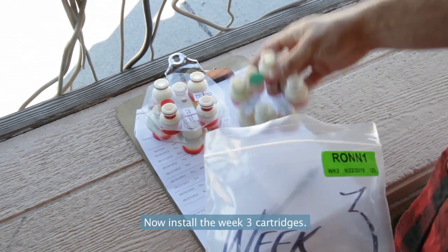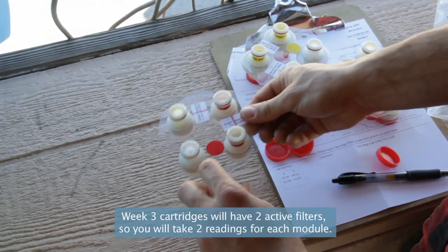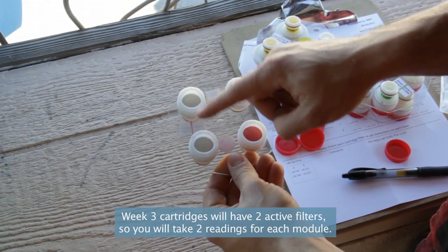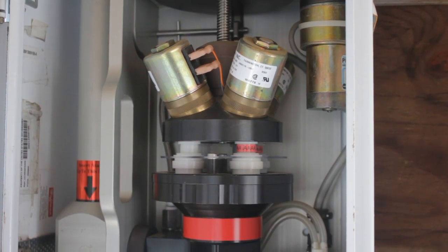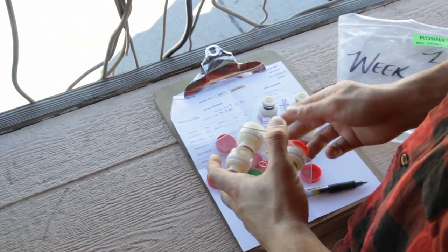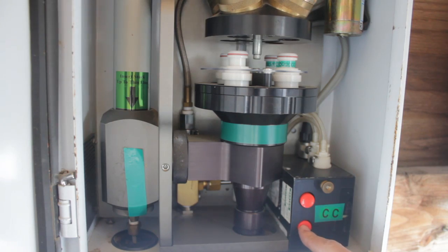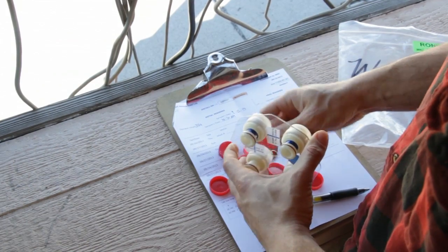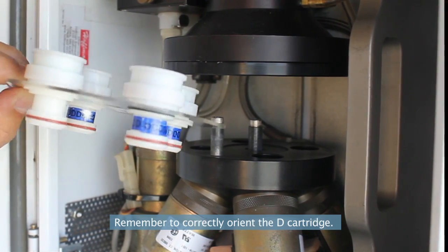Now install the week 3 cartridges. Week 3 cartridges will have 2 active filters, so you will take 2 readings for each module. Remember to correctly orient the D cartridge.